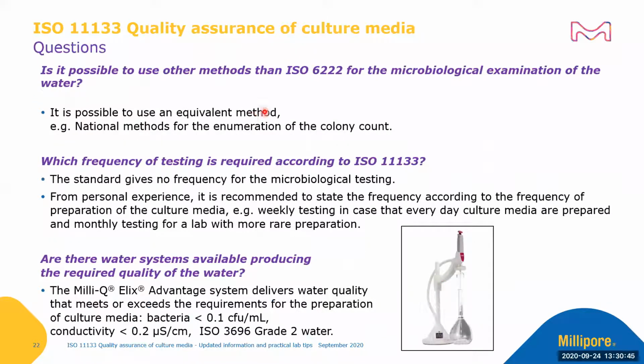Is it possible to use other methods than ISO 6222 for the microbiological examination of the water? Yes, it is possible to use an equivalent method, for example, national methods for the enumeration of the colony count. Which frequency of testing is required according to ISO 11133? The standard gives no frequency for the microbiological testing.